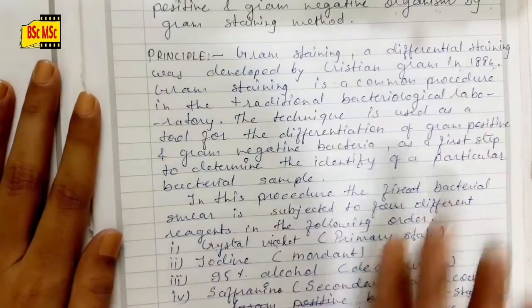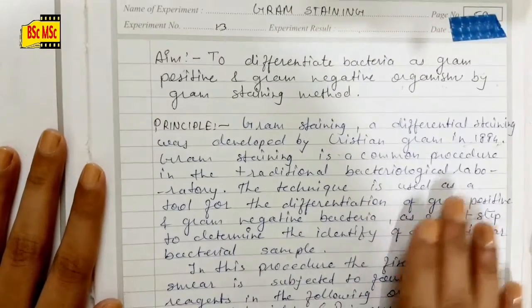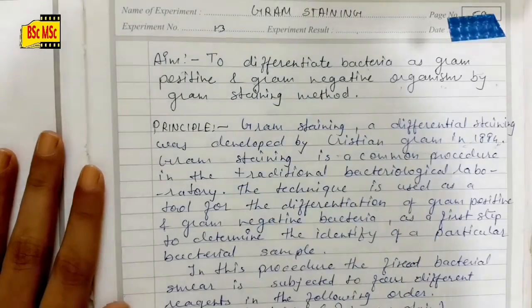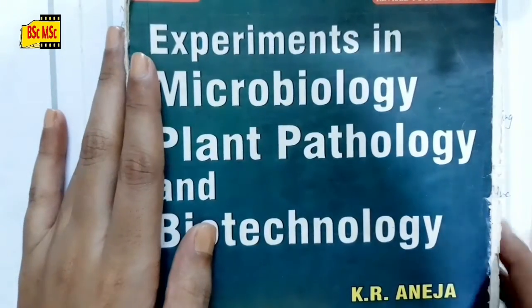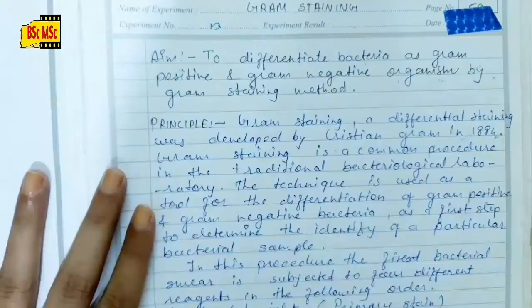This principle you can study from any practical book or from your teacher, from anywhere, but I have studied this from my favorite book, Aneja, and you also can buy this book and study the full principle of gram staining. So let's start the procedure.